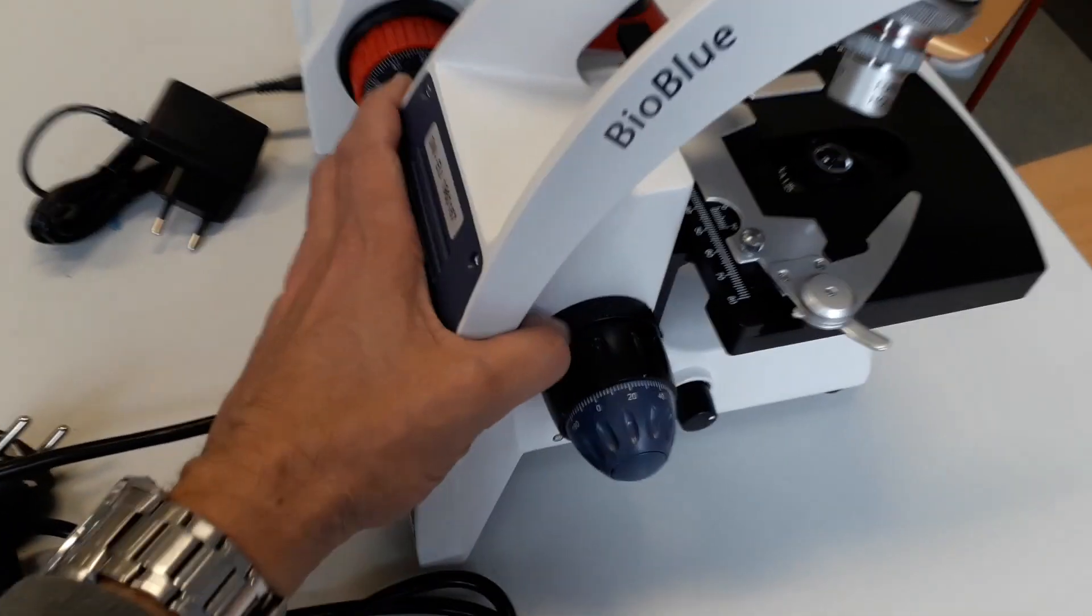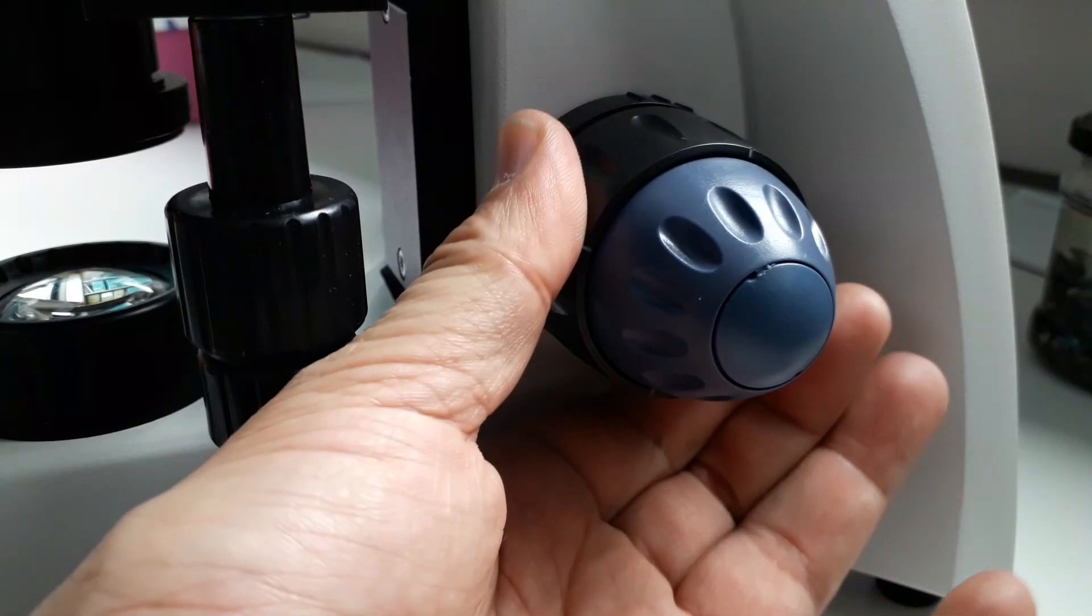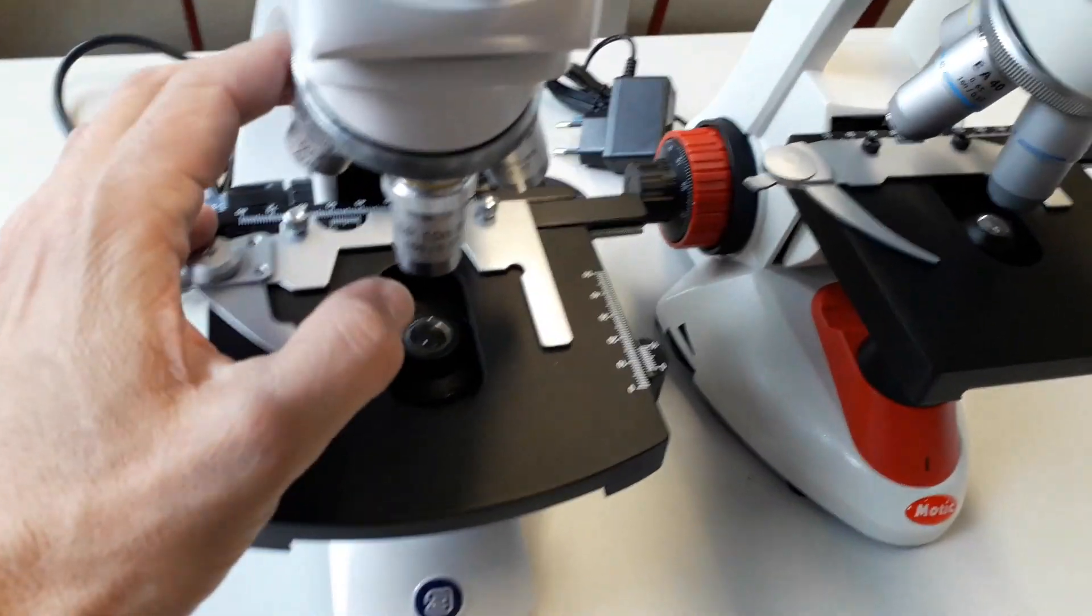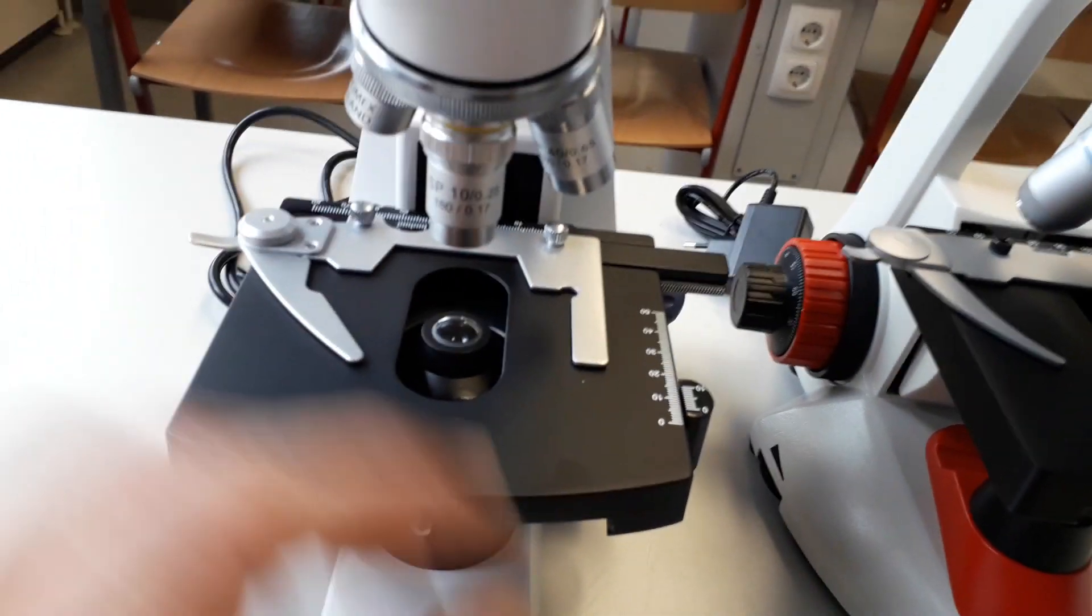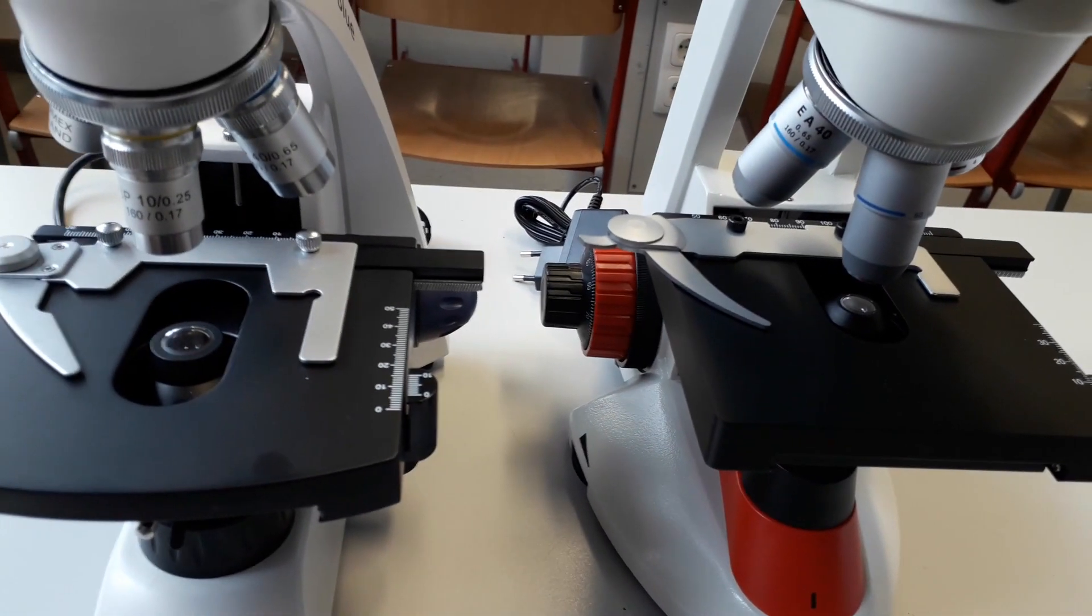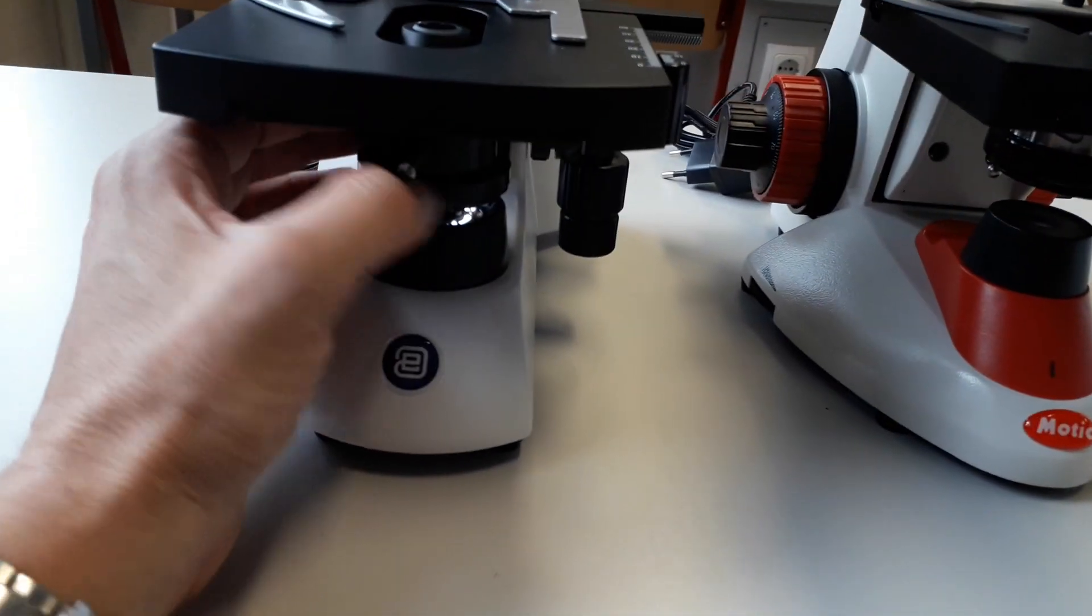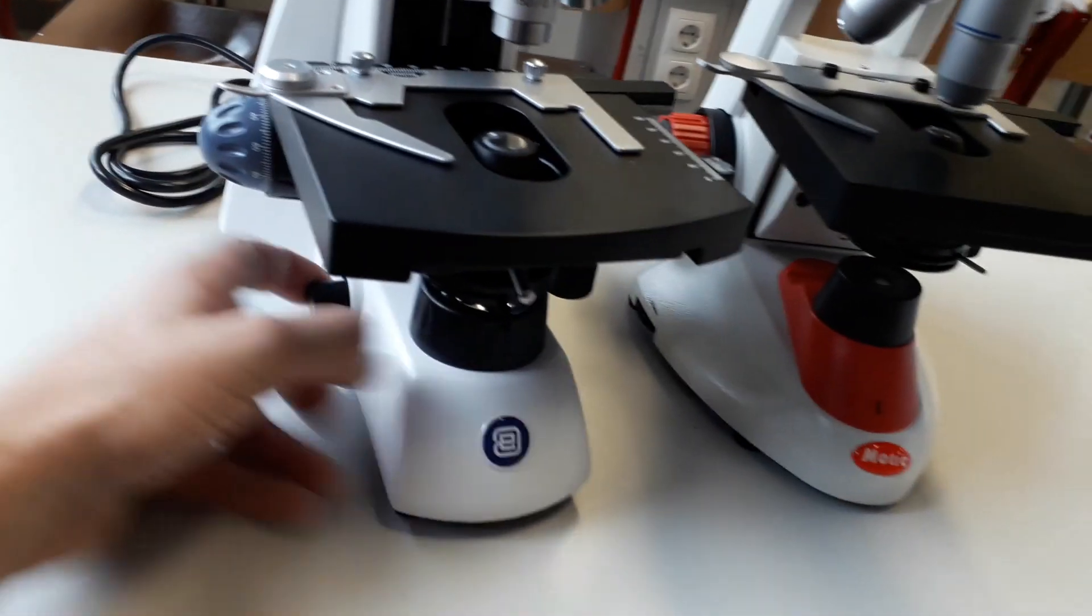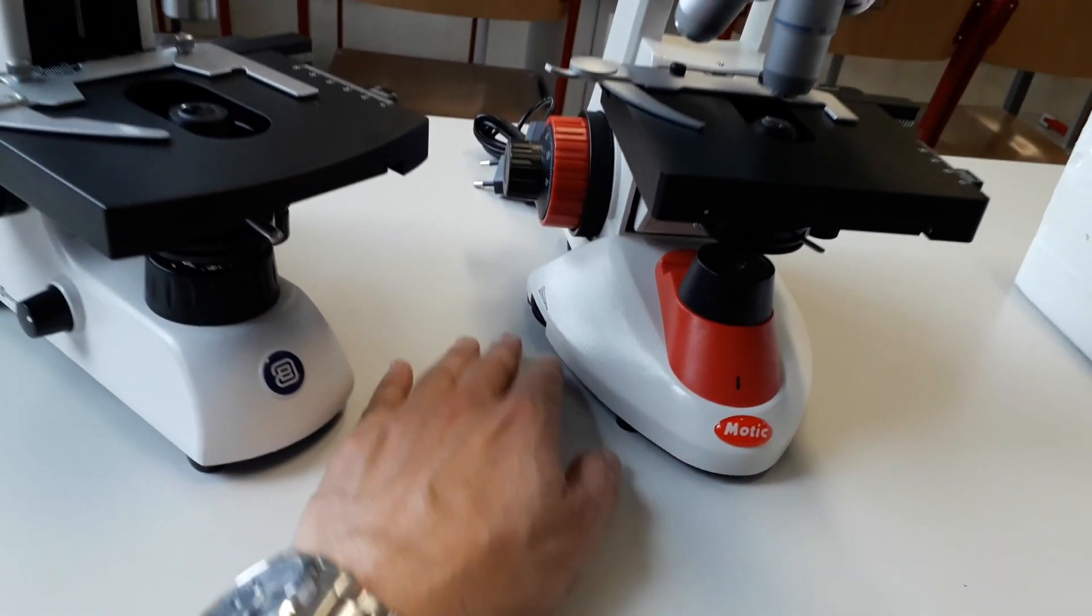Let's walk on the other side. The other difference is the size of the focusing knobs. But even that is actually really totally irrelevant. Third difference is that the brand of the objectives is different. I don't know which one has now a slightly better quality. But honestly, for educational use, it really doesn't matter. I know these objectives, they work just fine. I don't know these here. I wouldn't probably see a big difference. I'd have to test this out. The condenser, both of them have a filter holder. Both of them can be raised and lowered. Both of them have an iris diaphragm. I don't know, maybe the light intensity is different. I have to see. The intensity regulator knobs are here. It's a knob that you turn. Here it's a wheel. Not a big difference either.